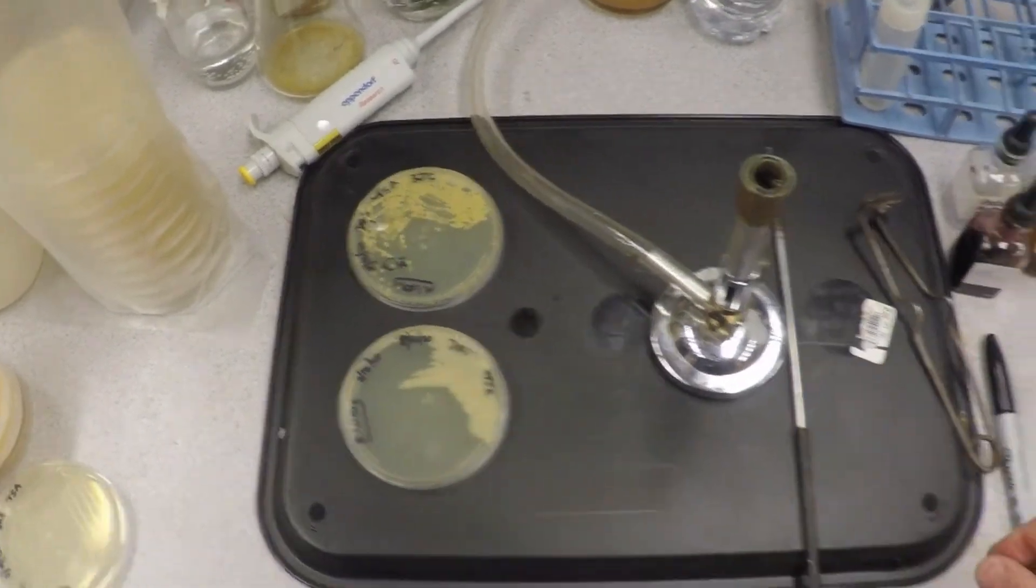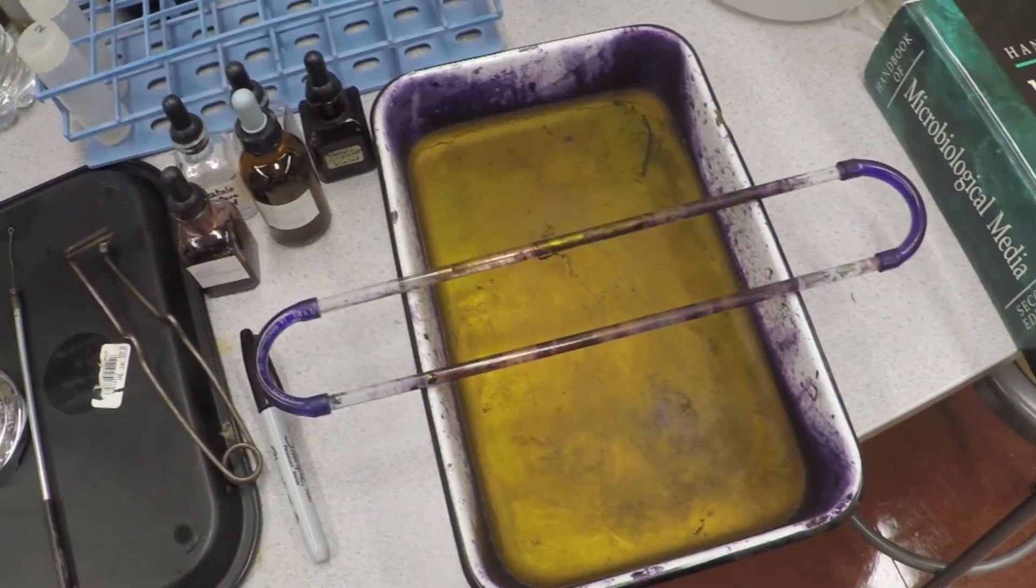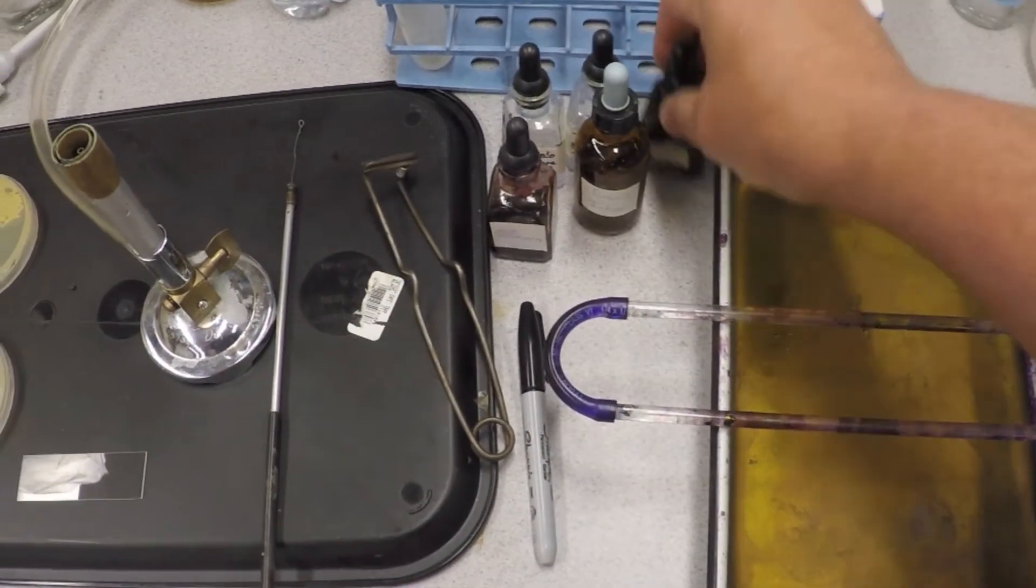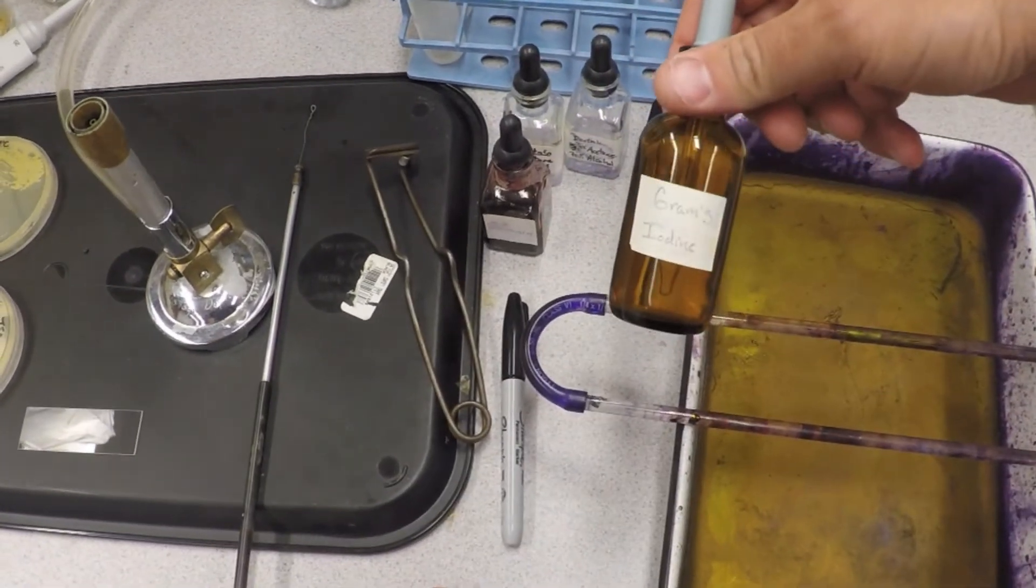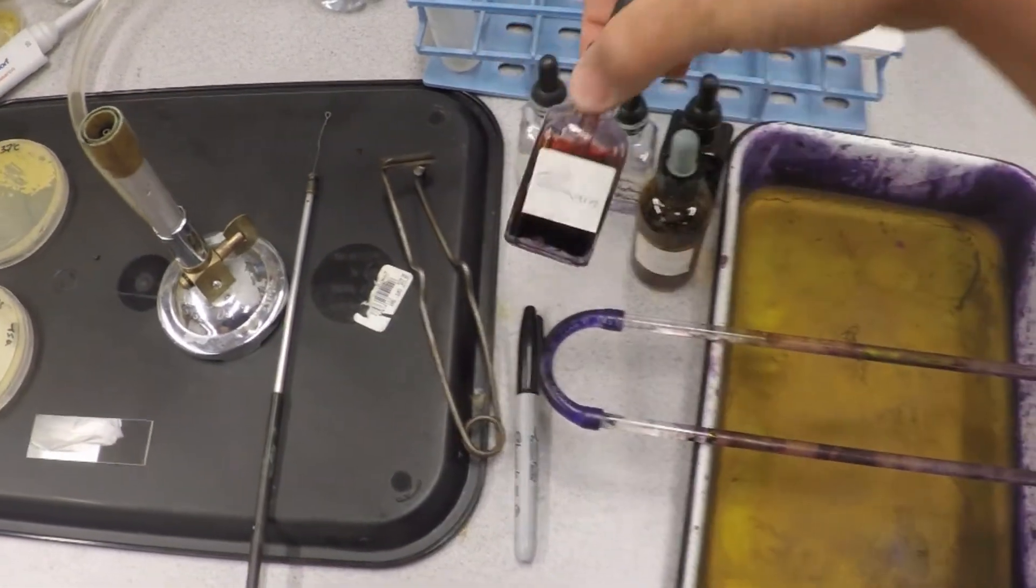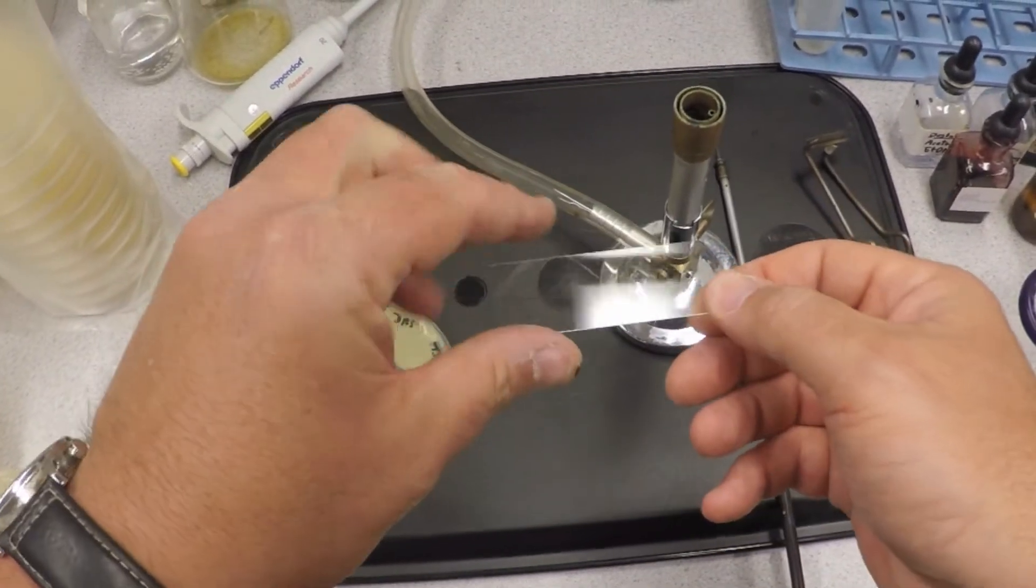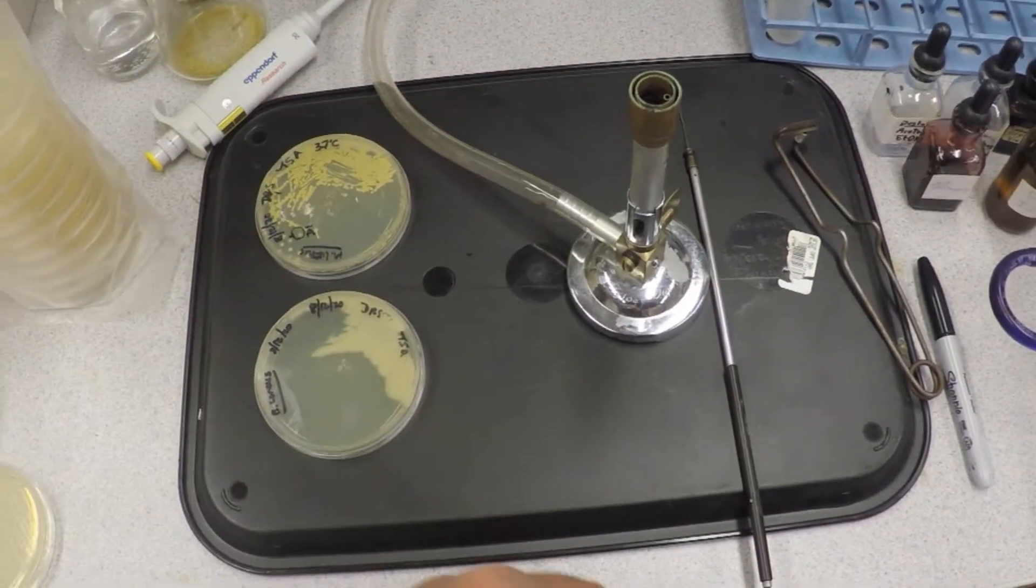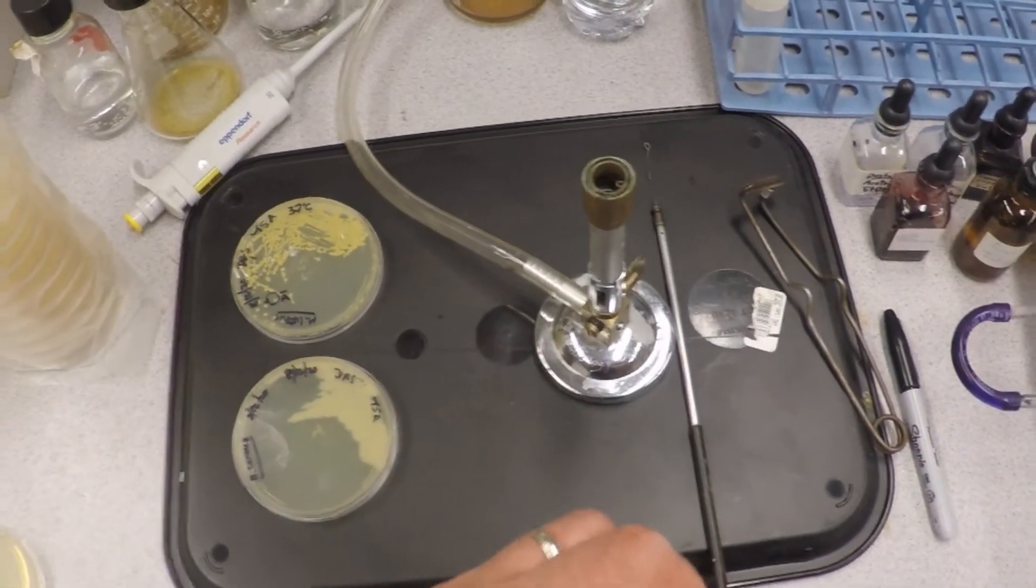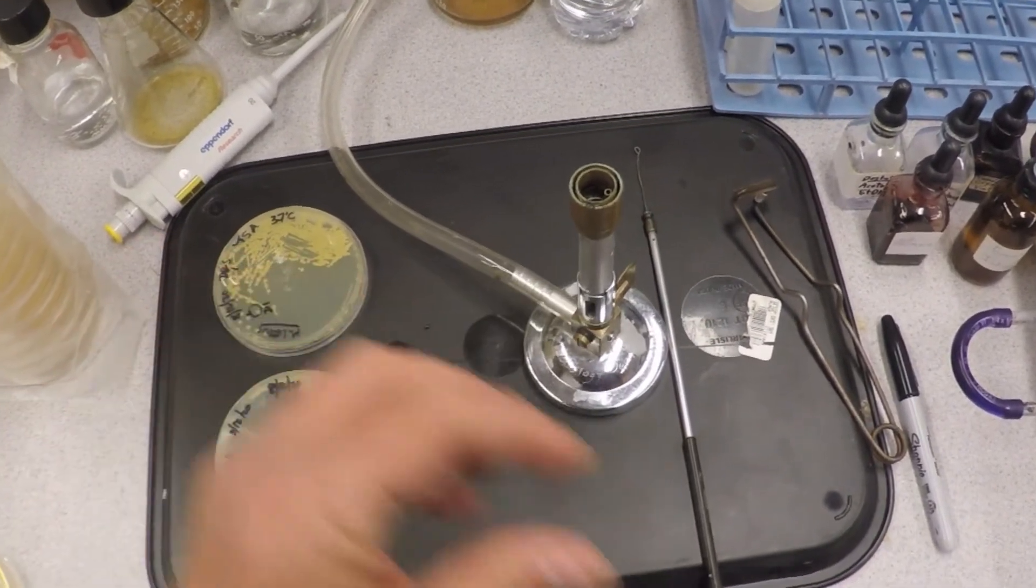You need Gram staining supplies. We've got a tray here with a little homemade rack to put your slide on and let things dry. Here is crystal violet, Gram's iodine, destain solution, and the counterstain safranin. The other thing you need is water and a slide. That slide is really dirty. This is what happens when you're away from the premises for so long.